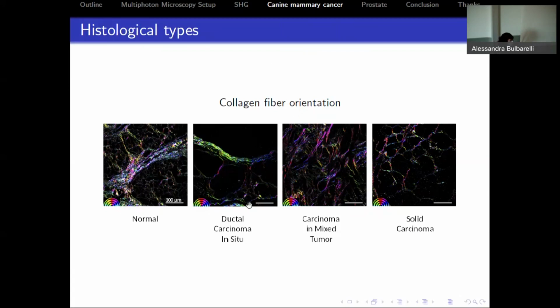But with the cancer ones, we can see, say, for this one, we have a much better aligned, thick area of fibers around this big cellular area grown, which is with the expansion of the cancer.